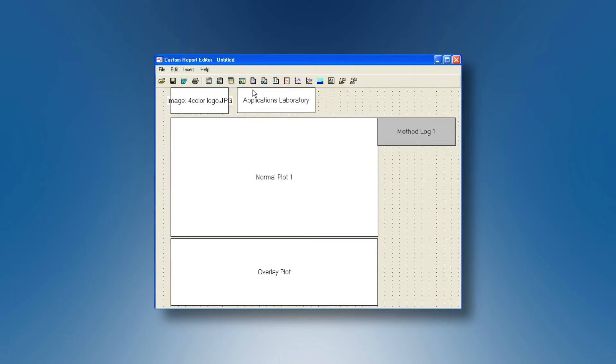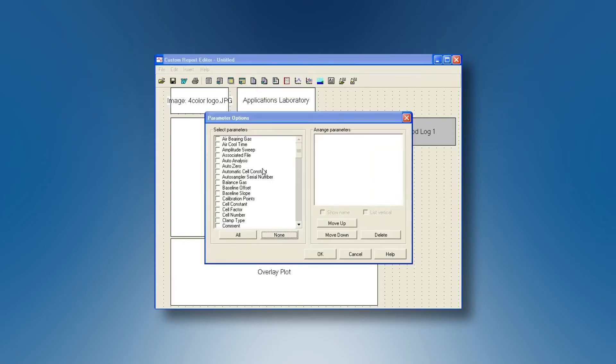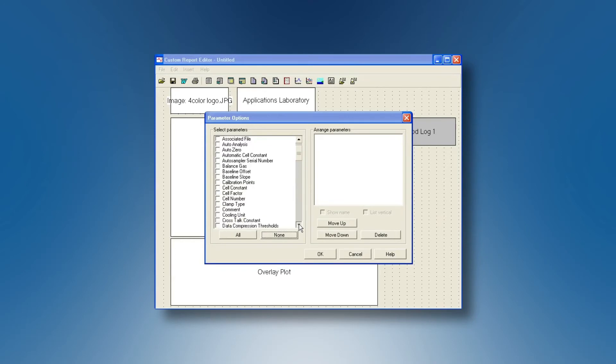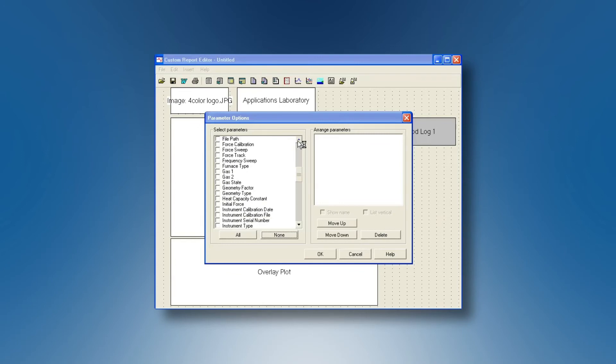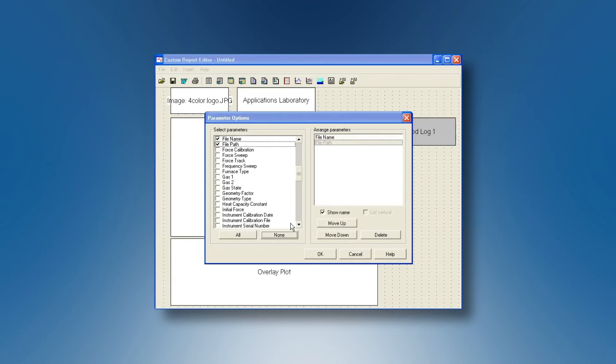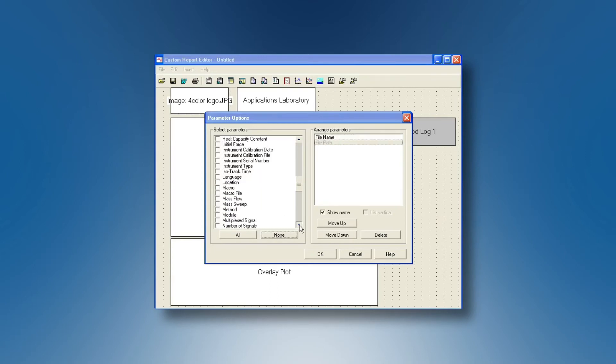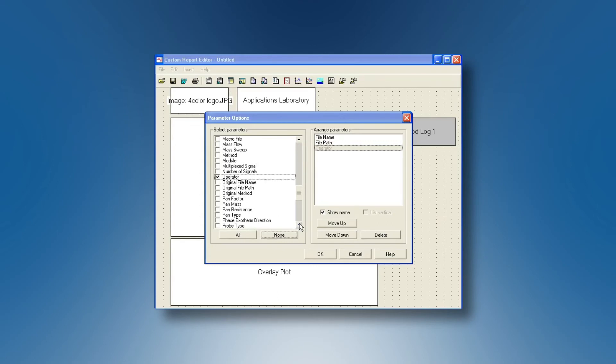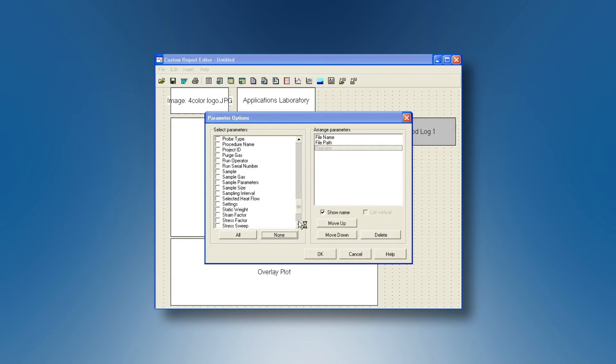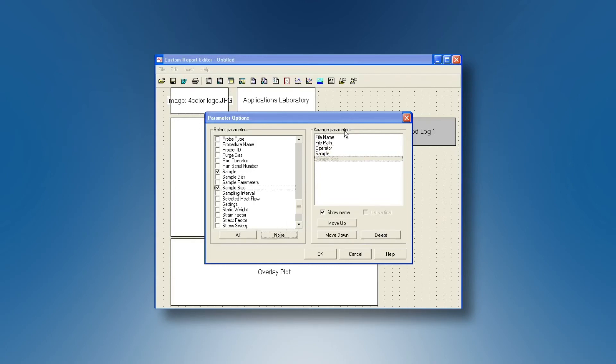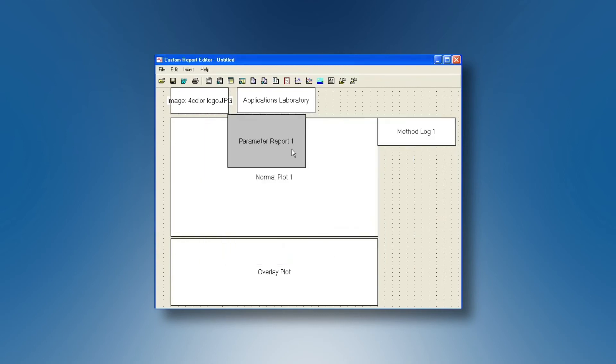And you can also of course have a list of parameters. So this list of parameters comes from here. You will decide what type of information you want to put it from the list here. For instance you will put file name and file path which are just here. You can put operator. You can decide also for sample name and sample size. You generate your list in the right part of the window and you click OK.